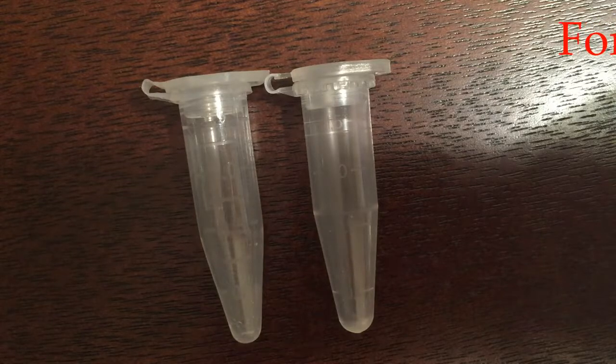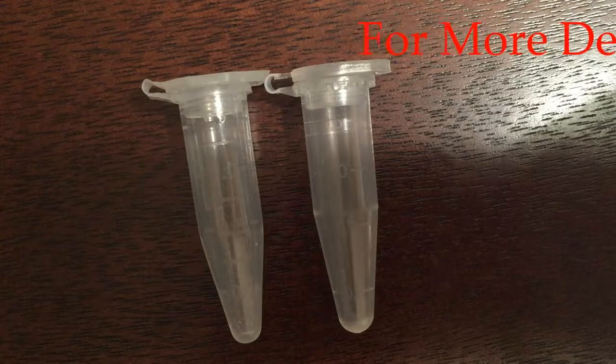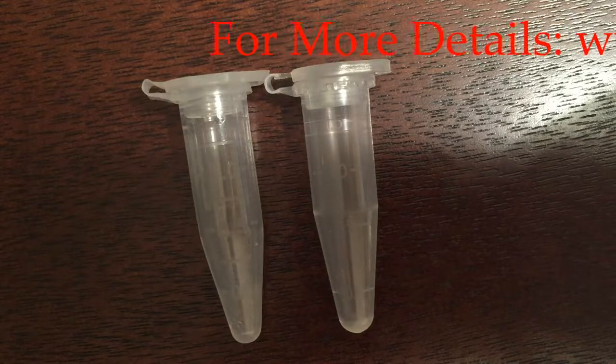I've recently received a few questions from customers pertaining to our microcentrifuge tubes. Specifically, people were wondering what differences, if any, exist between our 1.5 milliliter and 1.7 milliliter microcentrifuge tubes. In this video, I hope to address that question and provide a little bit of clarity on the issue.